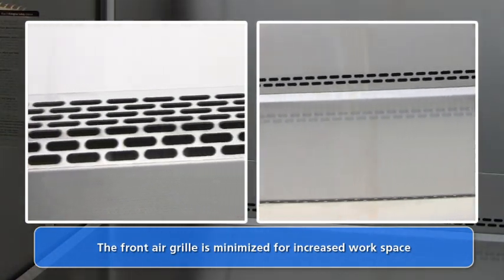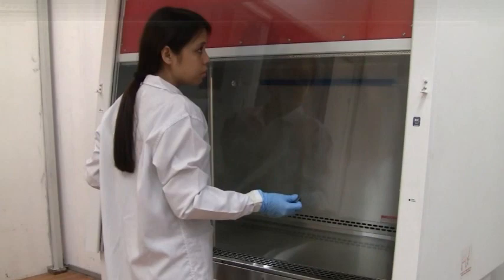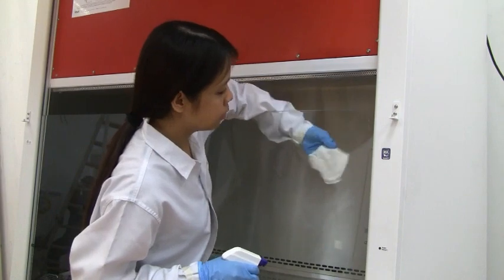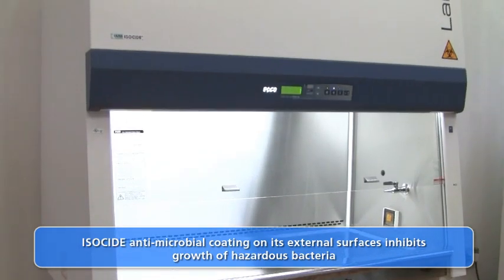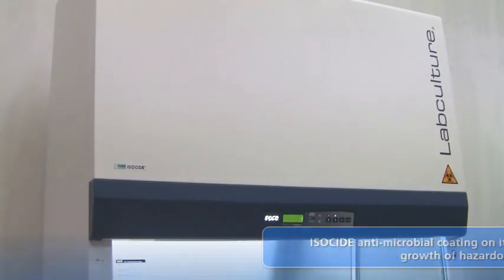The front air grill is a single piece with the work surface. The sash window can easily be cleaned using maintenance mode and the new sash cleaning feature. The isoside powder coating on the cabinet exterior dramatically inhibits the growth of bacteria, thereby ensuring no cross-contamination occurs due to contaminated surfaces.